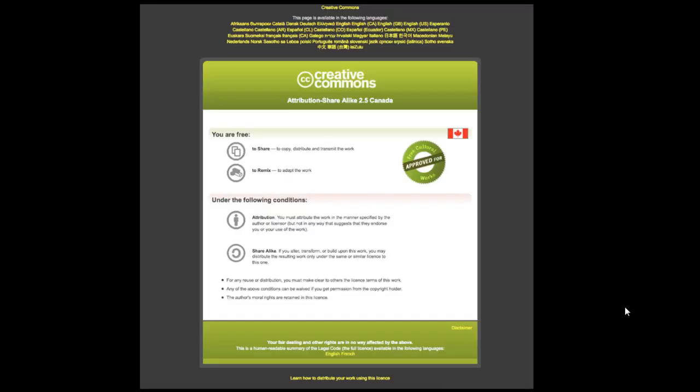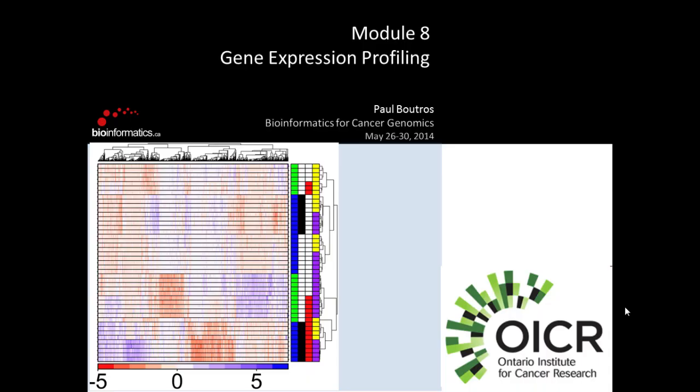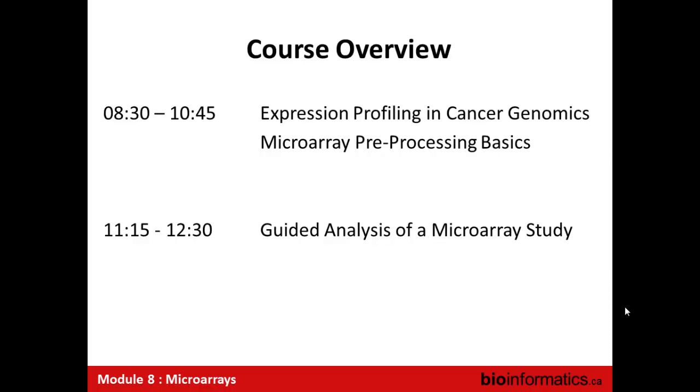Obviously, all the slides will be available to you, and you can use them as you wish under a Creative Commons license. And we're going to talk about gene expression profiling. We're going to talk about gene expression microarrays. We'll spend the first 2 hours, or two hours and 15 minutes, straight talking about what microarrays are like, how we pre-process them, what are the characteristics of the data. Then we'll spend the last hour and 15 minutes, hour and a half, after a coffee break, looking through how you analyze a microarray experiment.